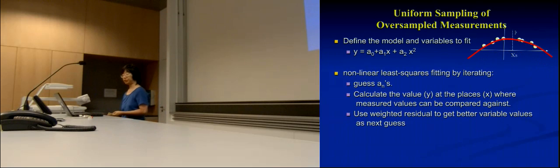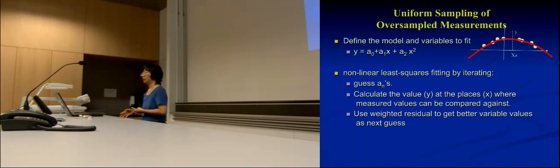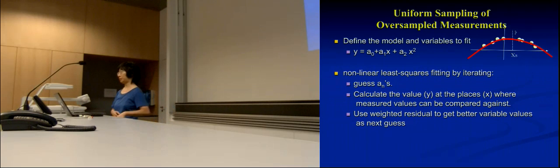Second thing you would do is some sort of least squares fitting. If it's a polynomial, you usually can use what they call linear least squares fitting. If it's some function that's more complicated, then you have to do a nonlinear method. Most of the time, the nonlinear methods are harder to apply, so you tend to have to make a guess at the beginning. And then there are algorithms, and you'll find that in books like Numerical Recipes, to apply that. First, you need to have a guess.